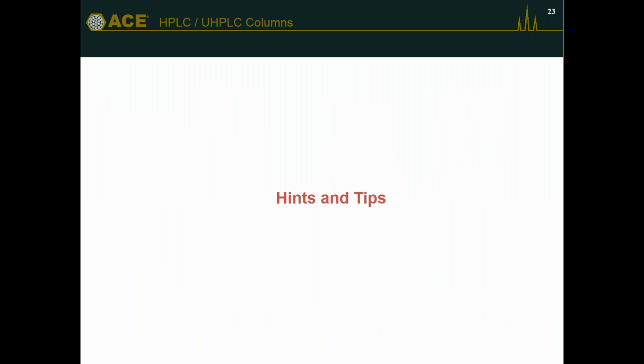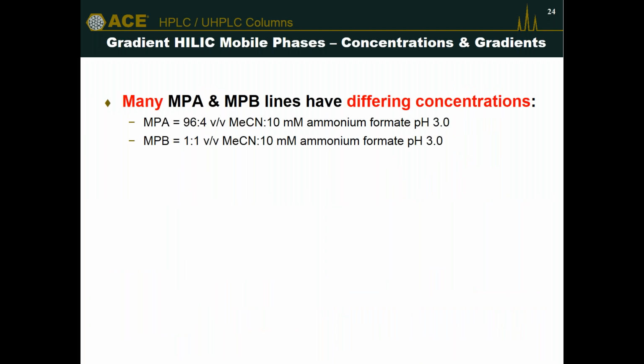So some general hints and tips. This is quite an important one. I think this is a really good one. It's just as applicable for reverse phase as it is for HILIC.